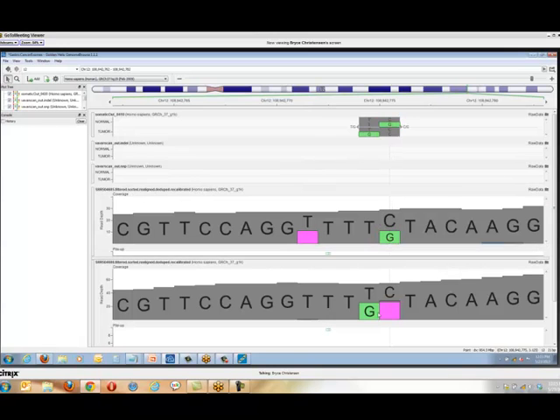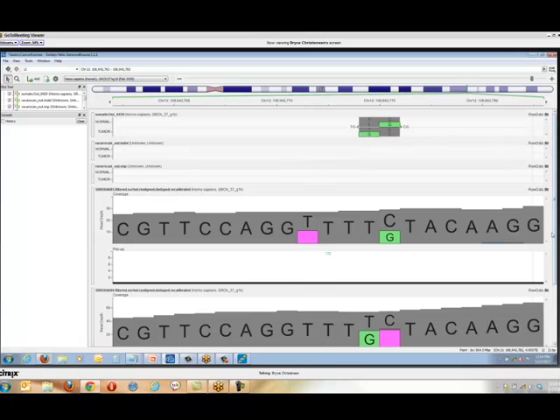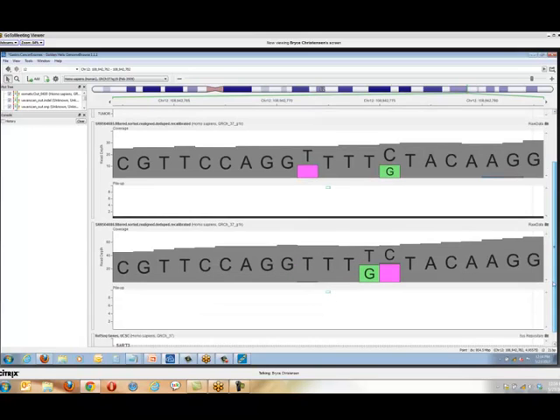While the second aligner instead called the fourth T to be a SNP, changing T to G, and said that the C allele was being deleted. Now, if you construct the haplotypes and look at what's exactly going on here, both of these alignments give the identical sequence. There's no somatic difference here. It is the same sequence both times, just two different ways of aligning it, even after using a local realigner that's supposed to correct all these problems.